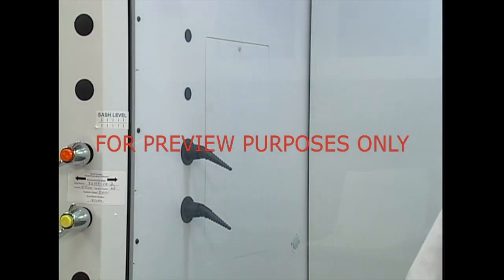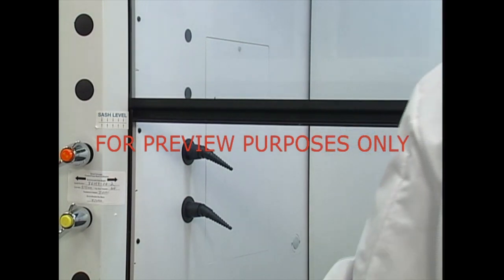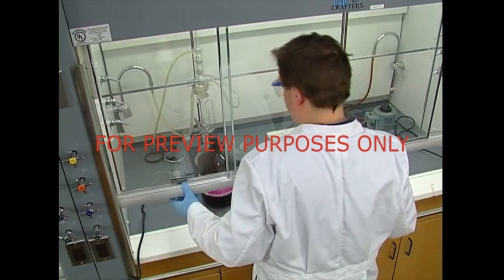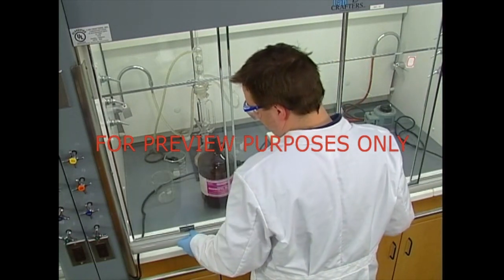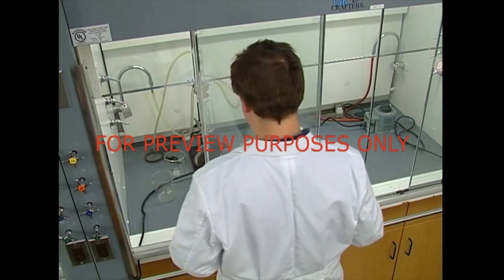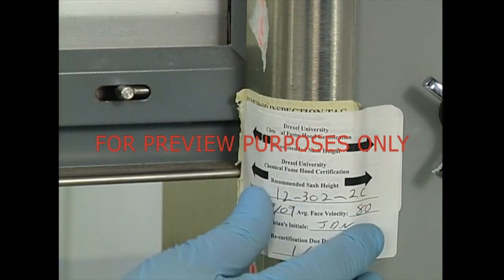Hoods also protect the operator from other physical threats. The sash provides protection from hazards like chemical splashes and sprays, as well as fires and minor explosions. Generally, you'll want to pull the sash down as far as possible, while keeping it at a level that allows you to work comfortably. Many hood manufacturers have determined the levels at which the sash in their hoods should be placed for maximum protection, so you'll want to follow their recommendations if at all possible.